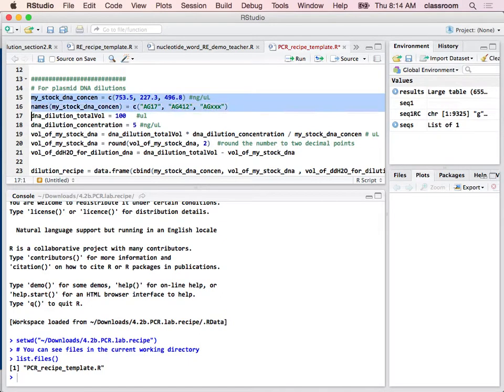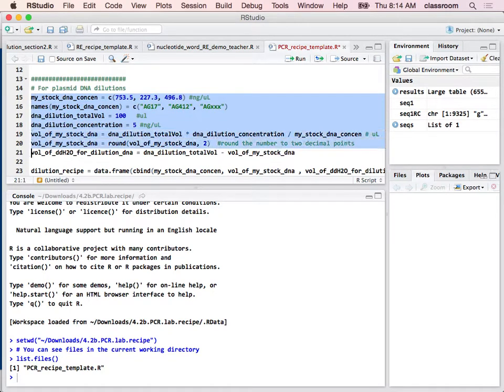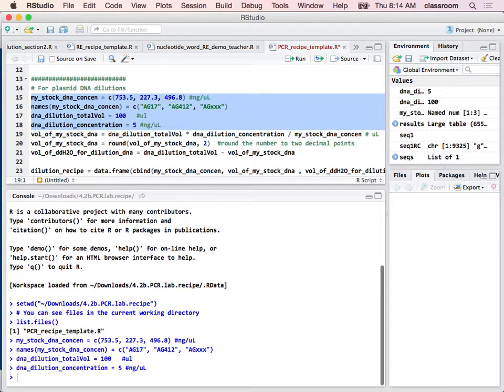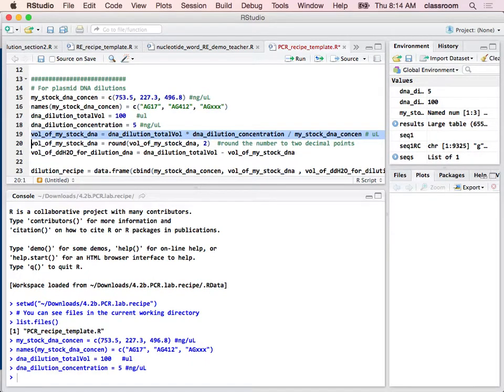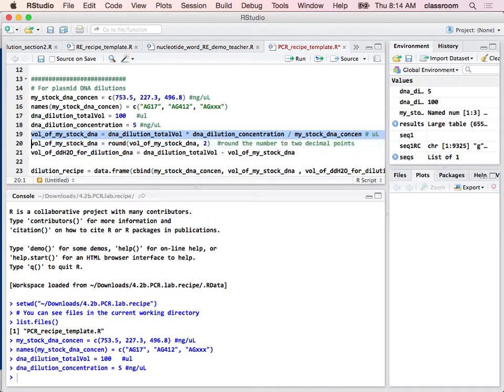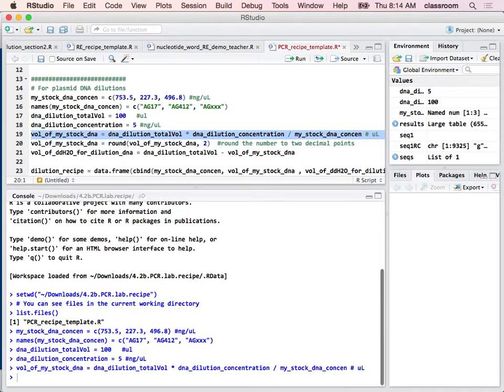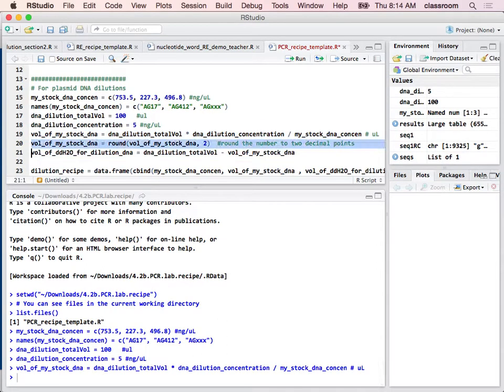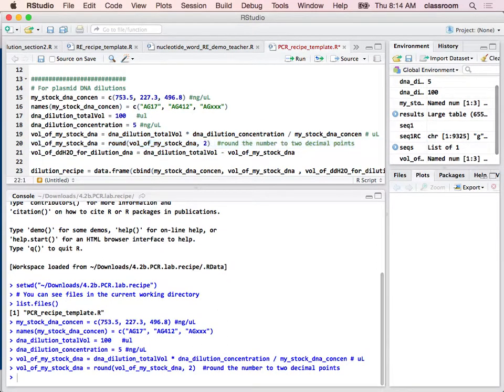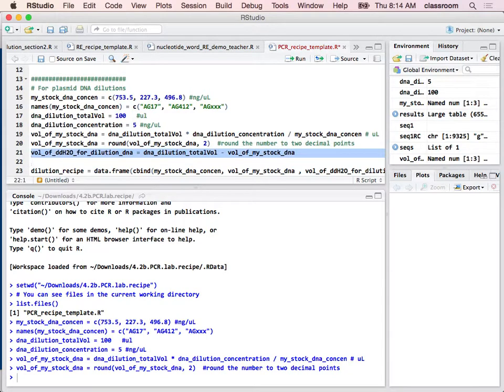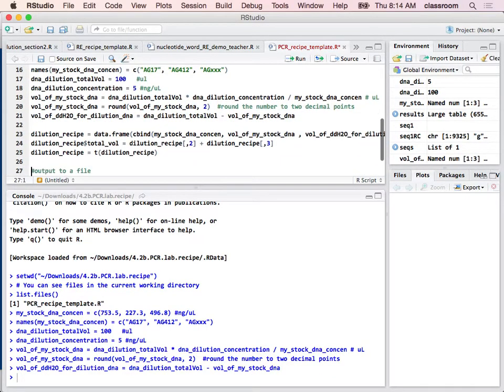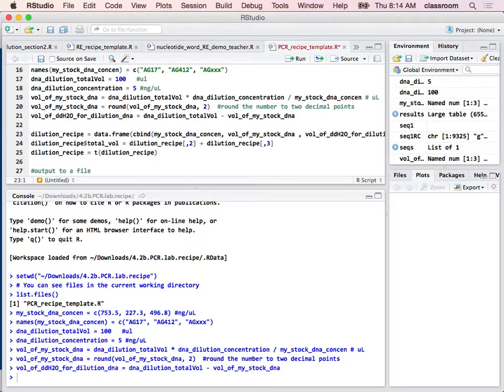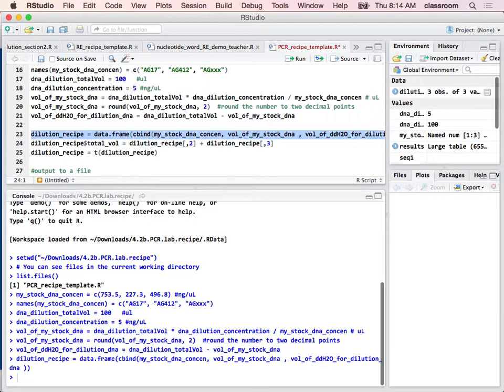And then the rest of it is basically the same. And this is basically, again, is C2 times V2 divided by C1. And that's your V1. And then I round up the number. So this line, line 20, is to round up the number. And then find out the water is for the remaining volume to make up the total of 100. So there, that's the recipe.